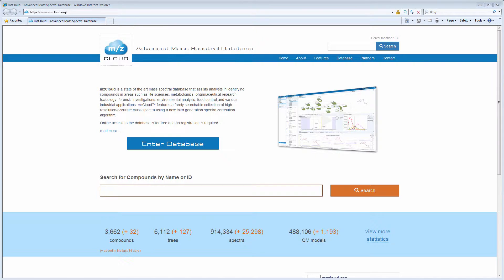Hello and welcome to MZCloud. MZCloud is a web-based mass spectral database that comprises a curated collection of high and low-resolution tandem mass spectra acquired under a number of experimental conditions.